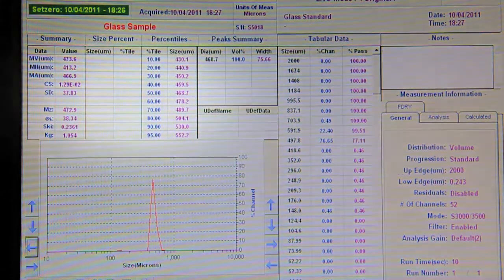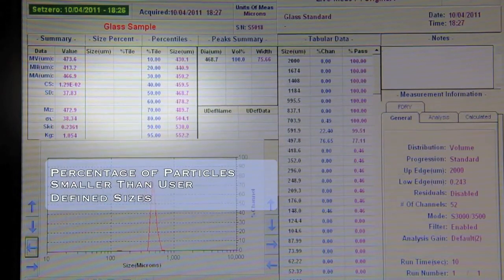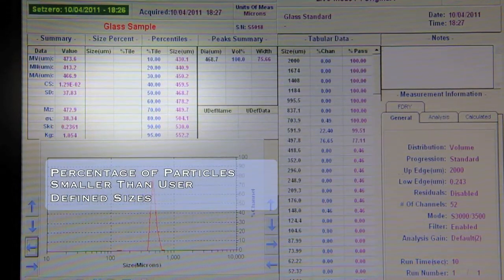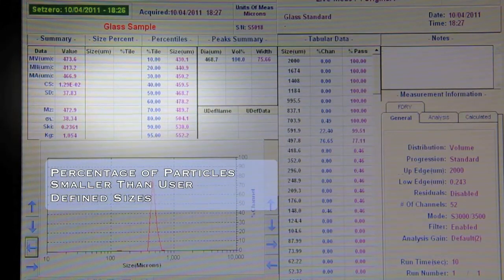The FLEX software shows information such as the percentage of particles smaller than a series of user defined sizes. For example, if you key in 50 microns, the software will tell you what percentage of the sample is smaller than 50 microns.